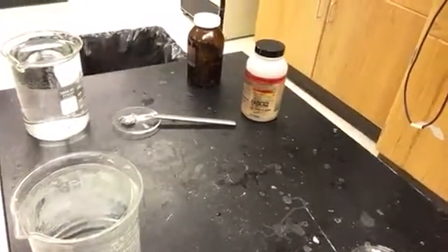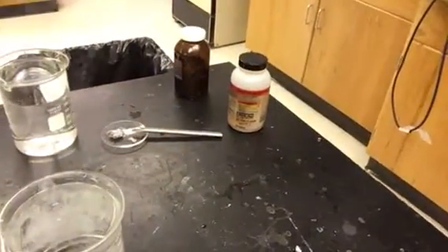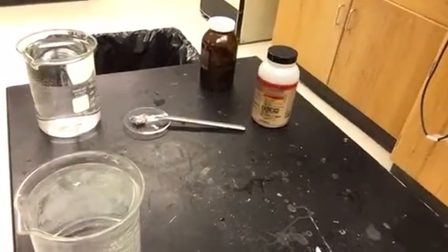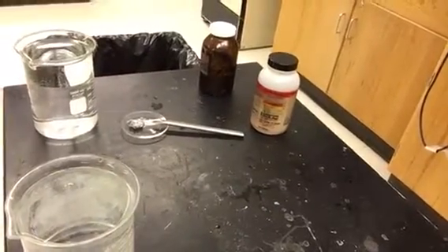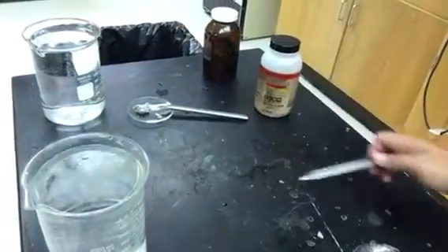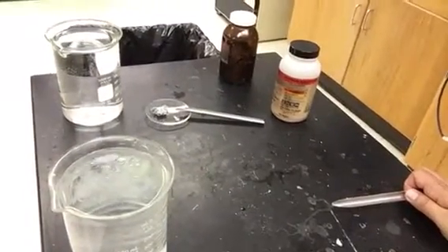It's reacting with the water, obviously, giving off some sort of smoke. That's actually just water droplets, but it's moving all around. That's a gas. That's one of the products that's pushing it around. And it can actually get very hot. It's also making another product. It's making a sodium hydroxide solution, so I don't want to touch that water now because that's a base, the opposite of an acid.